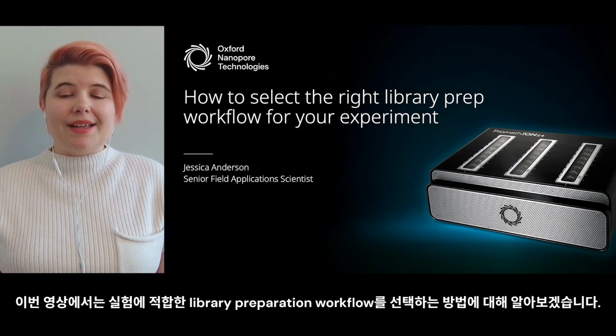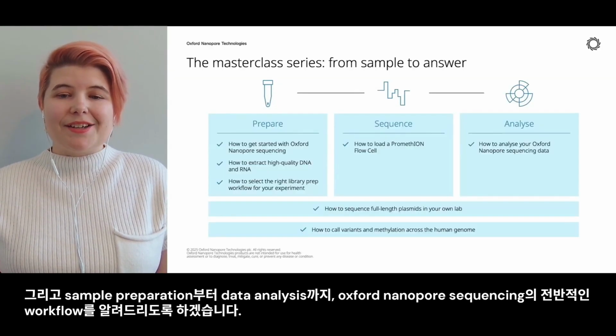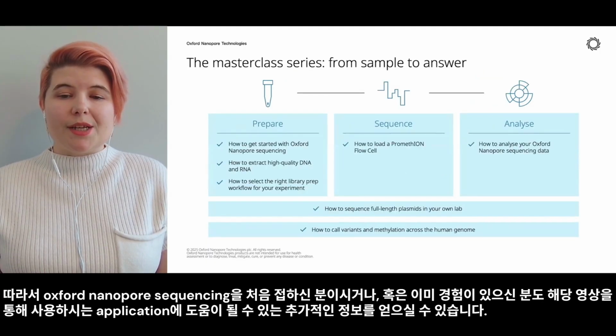In this masterclass, we will be discussing how to select the right library preparation workflow for your experiment. In this masterclass series, we will guide you through the Oxford Nanopore workflow from sample preparation to data analysis, so that whether you're new to Oxford Nanopore sequencing or are experienced with the technology, you can learn more to support your application.